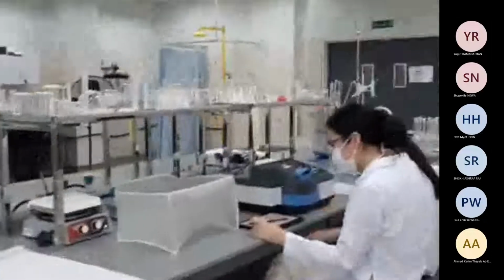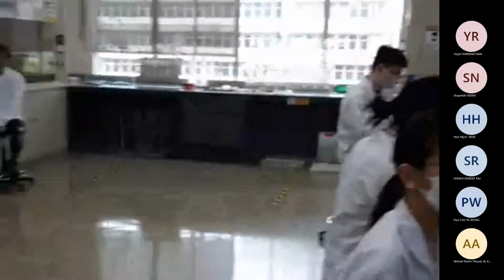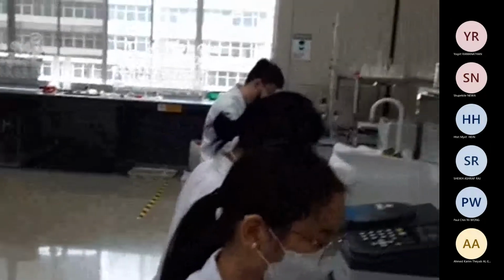So the solution should be given somewhere here. The other side, yeah. So it should be in fume hood 5. The solutions and unknown and everything is given. Take from there, fill up your burette, and then you prepare the solution according to the steps that are given, right?